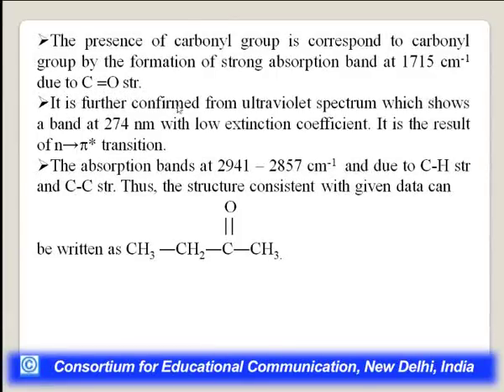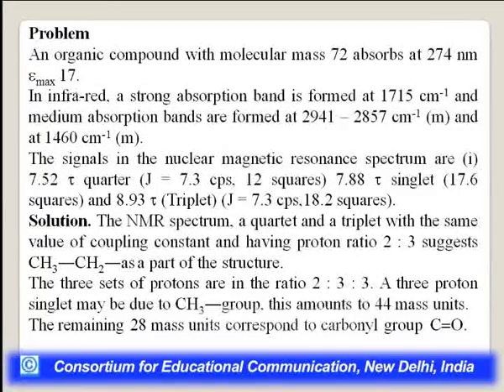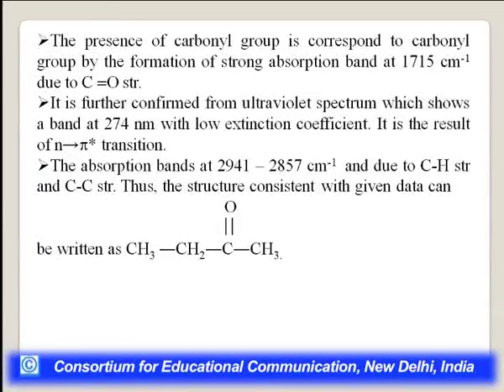It is further confirmed from the ultraviolet spectrum, which shows a band at a value of 274 nanometer with a low extinction coefficient, that is, we have seen it was 17 if I am not wrong, and it is the result of the n to pi star transition.